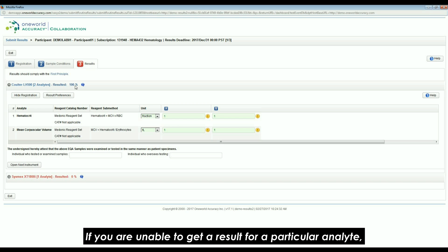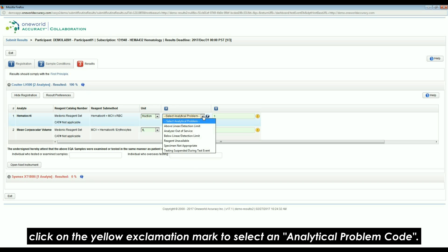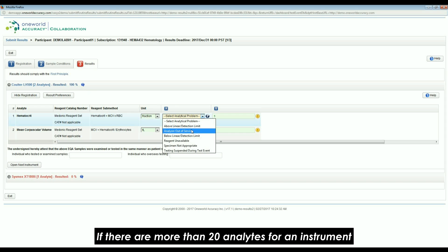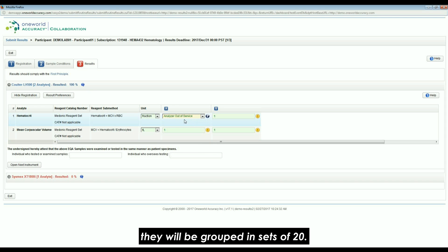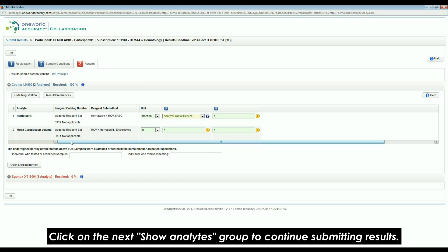The progress of result submission for an instrument is shown as a percentage next to the instrument name. If you are unable to get a result for a particular analyte, click on the yellow exclamation mark to select an analytical problem code. If there are more than 20 analytes for an instrument, they will be grouped in sets of 20. Click on the Next Show Analyte group to continue submitting results.